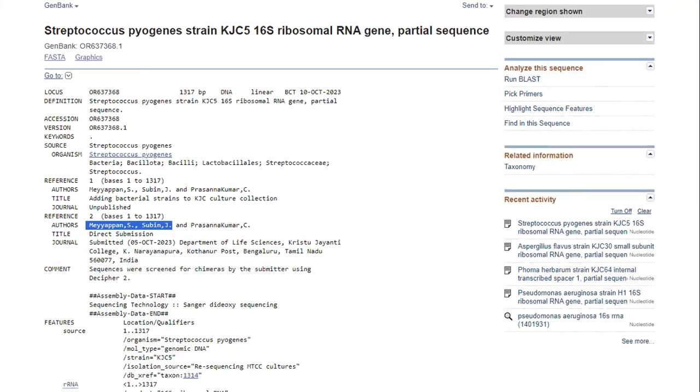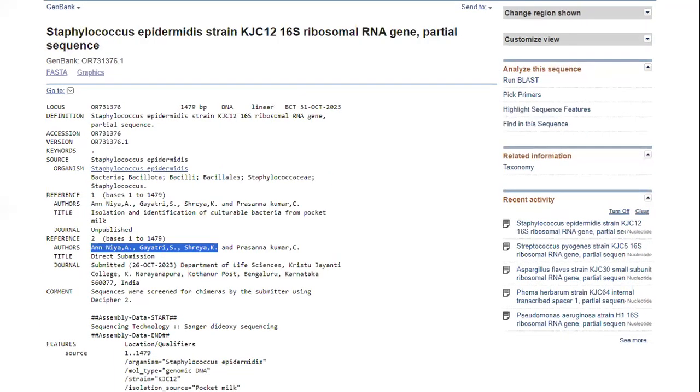Okay, once the sequencing is done, you can use a BLAST analysis to check with a cutoff score of more than 99% similarity with any sequences, along with your classical data, traditional taxonomical data. You can know what species you are looking at. That's how bacterial species are diagnosed in microbiology labs.